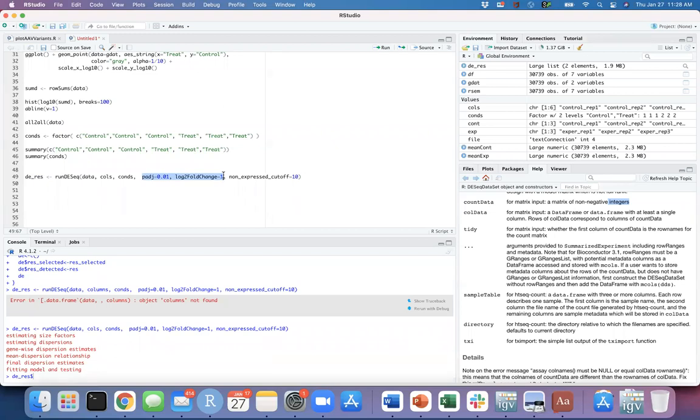Detected genes are going to bring all the genes after eliminating those zero count genes. It means those are detected molecules or the detected genes in your bulk RNA. That's why we say detected. Selected is selected using these cutoffs.